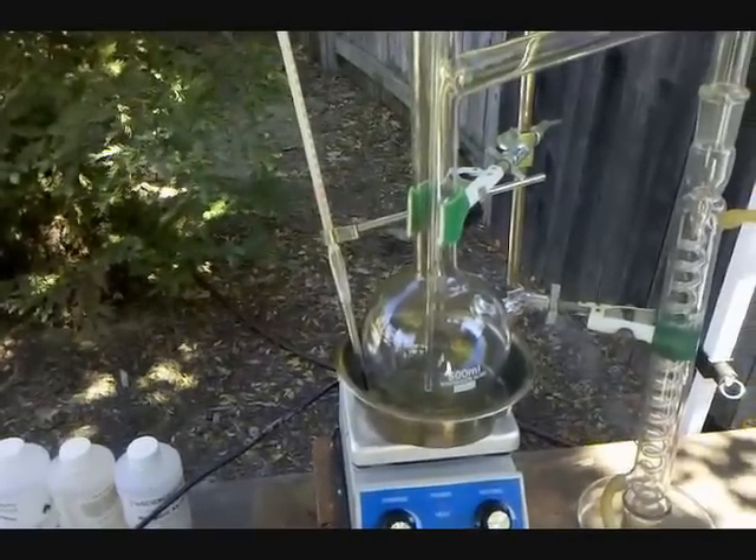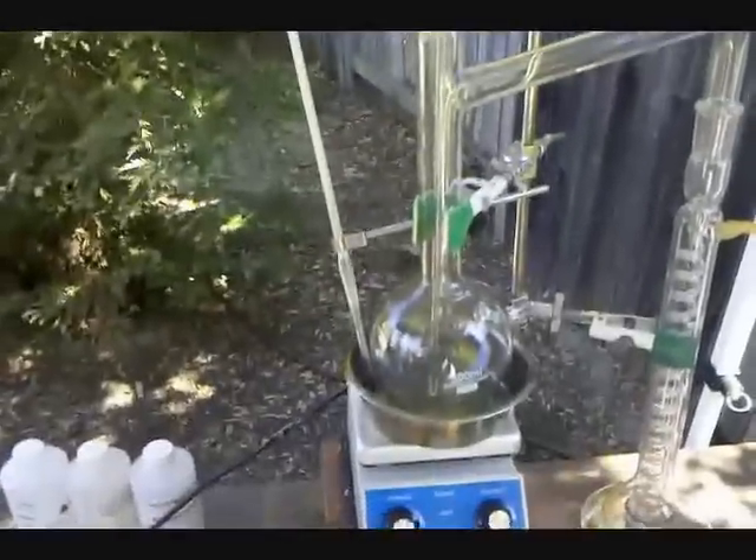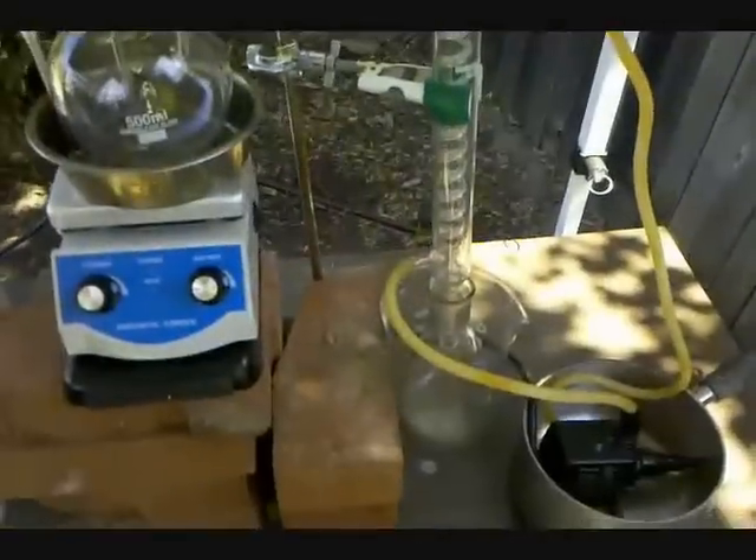Hey everyone, in this video I'm going to be synthesizing ether. So this is my distillation setup, and before I begin I just want to show you how it works.